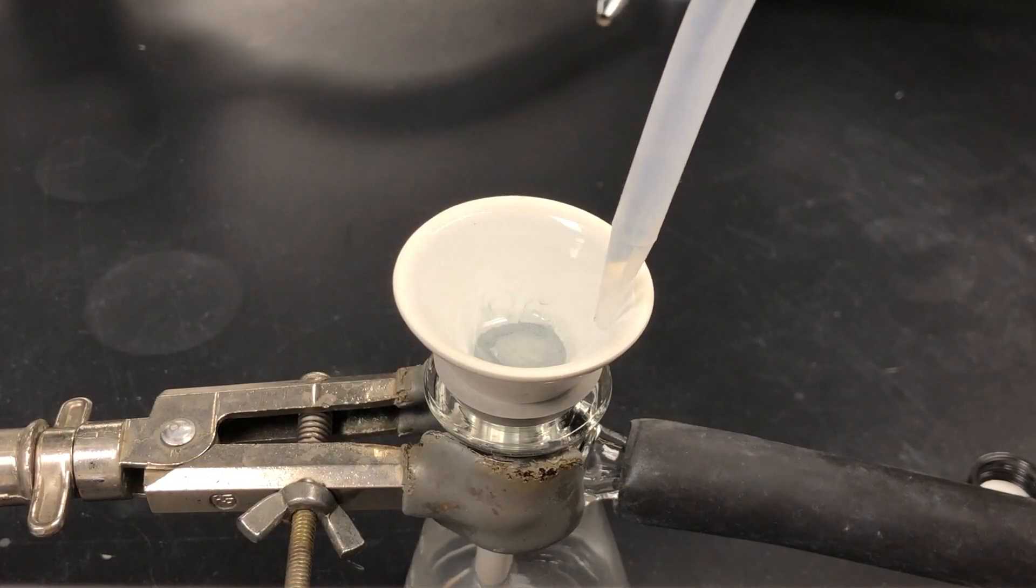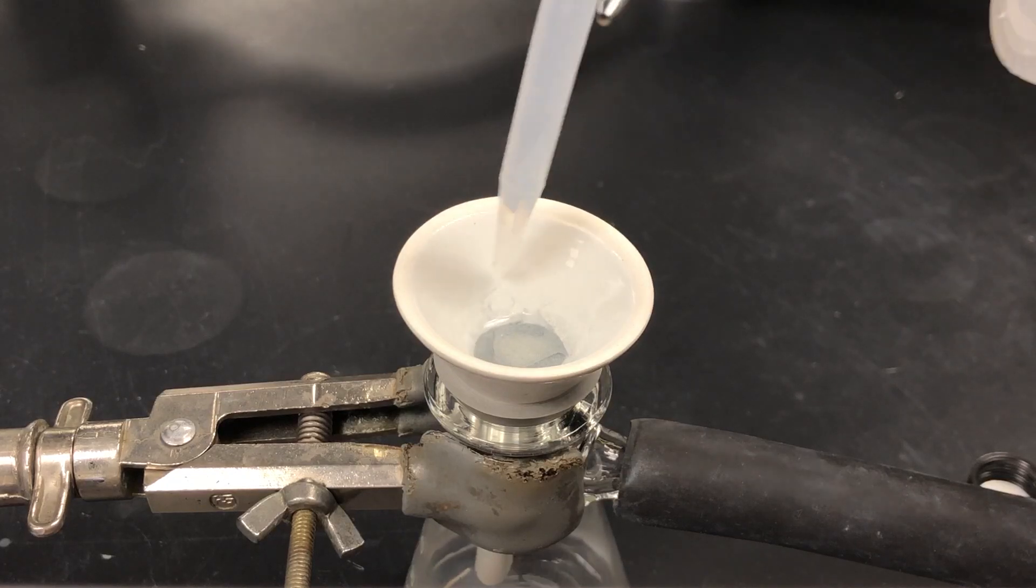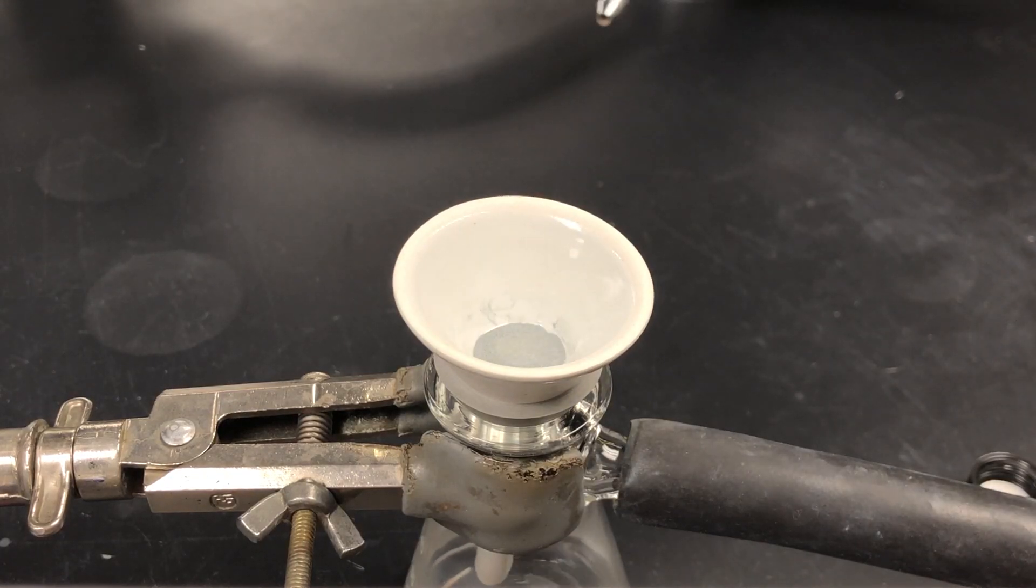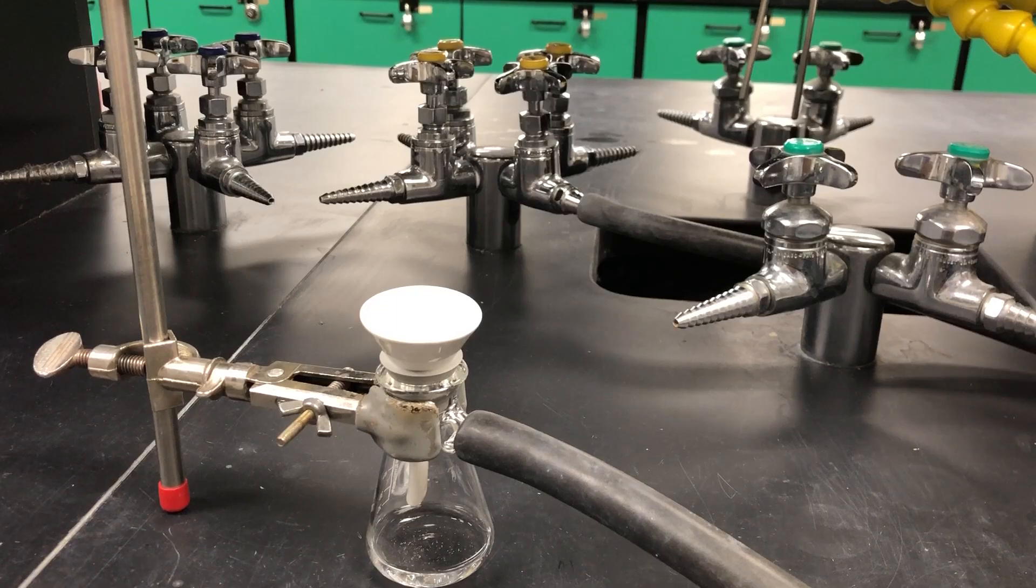You may also need to rinse the Hirsch funnel itself with multiple solvents, depending on what you are using in your experiment. Leave the vacuum filtration system running for a few minutes until your precipitate is dry.